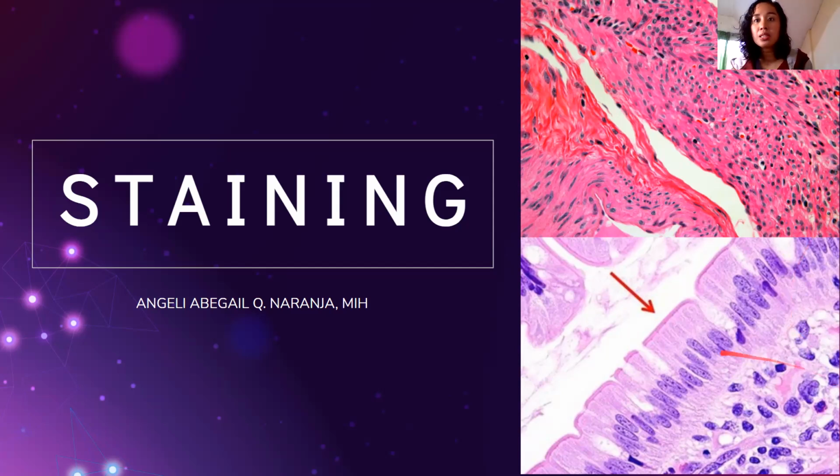Okay, here, these are columnar epithelial cells. Your nucleus looks blue-black, blue-purple in color. The cytoplasm of the columnar epithelia, guys, is light purple. And this border where the arrow is, these are your microvilli. So, this is a good stain, guys, because the microvilli are very evident. So, that is what we will discuss today.